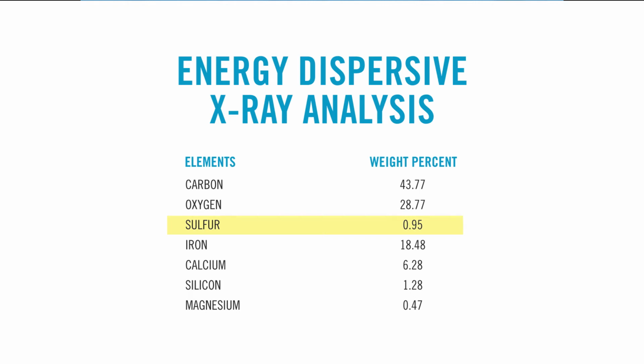When we analyze new membranes, we typically see between 5 and 7 weight percentage of sulfur. If there's a foulant layer present, it will mask that sulfur weight percentage, so we'll see much lower values. In this situation, we see only 0.95 relative weight percentage of sulfur. The sulfur weight percentage value is much lower because there's a thick layer of foulant masking the membrane surface.